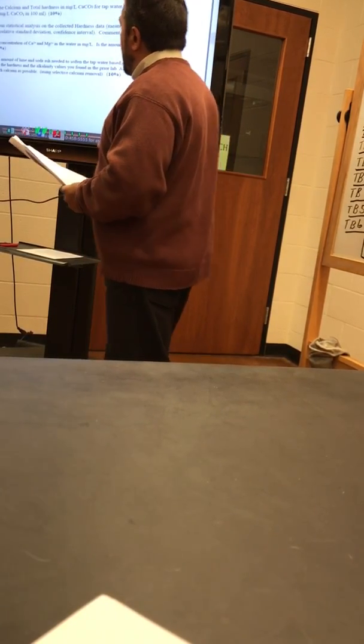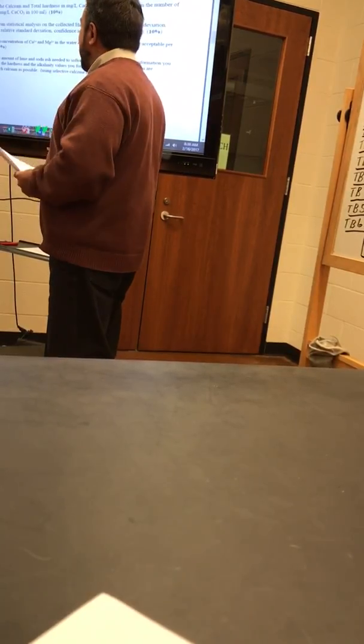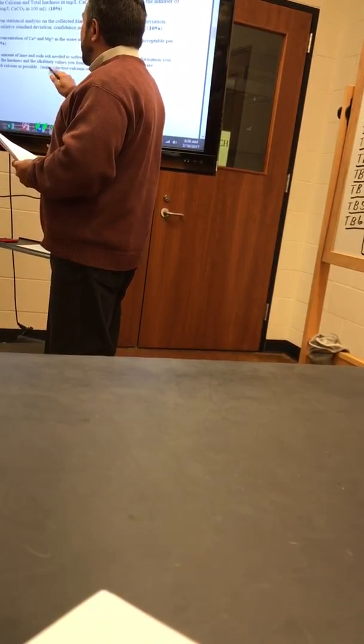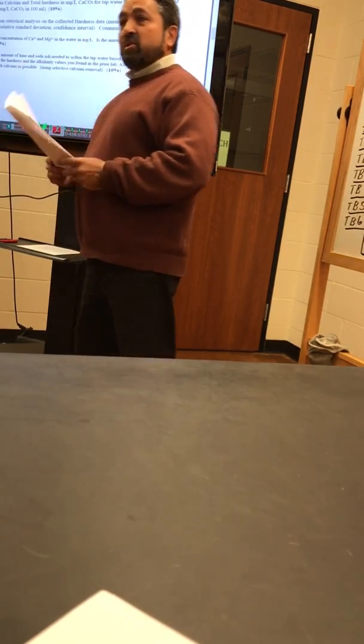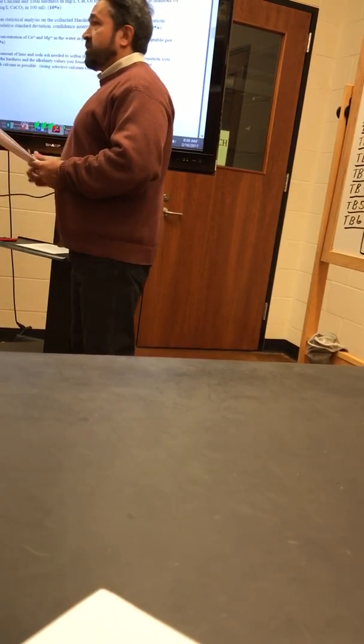Okay? And then this is the biggie, the softening, that Dr. Thomas is talking about now. So once you get all your numbers, you can create the bar graph. You can figure out where all your anions and cations lie, and then you can figure out the amount of lime and soda ash, if there's lime and soda ash needed to soften, depending on where your anions and cations line up in your bar graph.